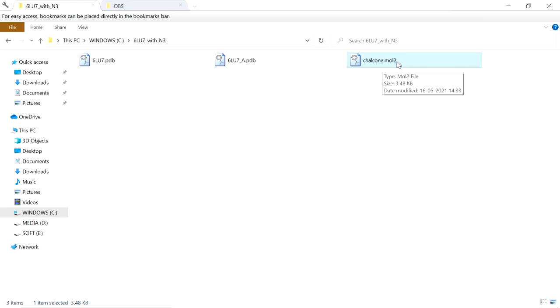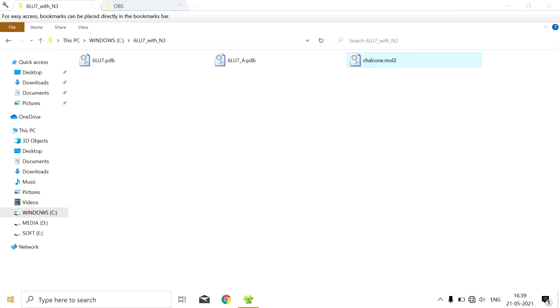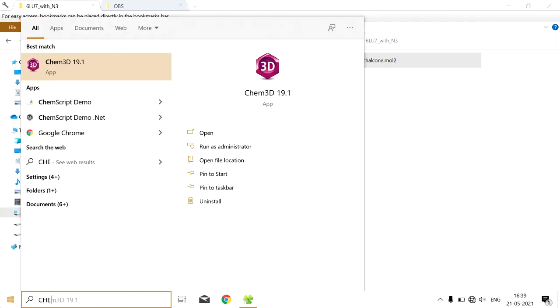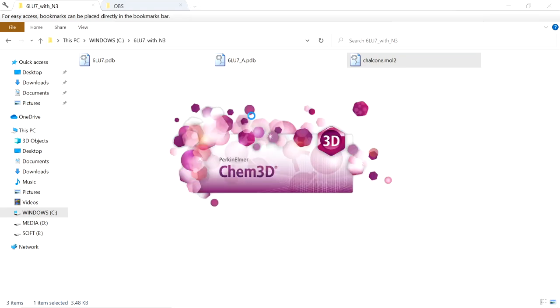Before that, we have to energy minimize the ligand molecules. This is the ligand chalcone. We have to energy minimize the ligand, and for that we are going to use Chem3D.